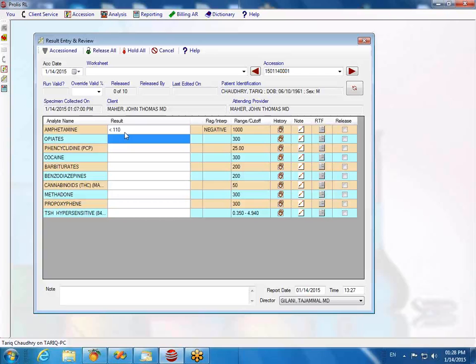Got you. Okay. Can we change that rule? Oh, absolutely. You want me to show it to you right now or later? We'll show it later. It's fine.